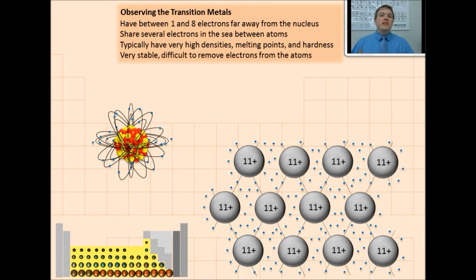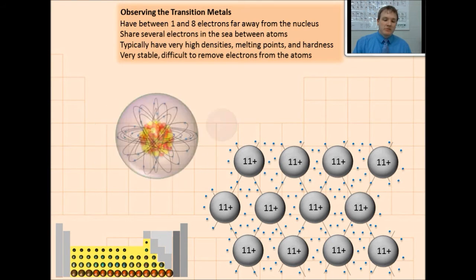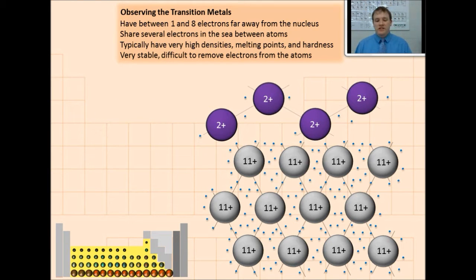During this lab, we are going to take zinc atoms and we are going to use them to coat the outside of copper. We're going to take a penny, we're going to put it into a soup of hot zinc dissolved in water. There's going to be zinc chloride or zinc acetate, and there's going to be zinc metal. So we're just going to make this soup of zinc ions in really hot water, and those zinc ions are going to deposit themselves on the outside of the copper penny, like you see in this picture.